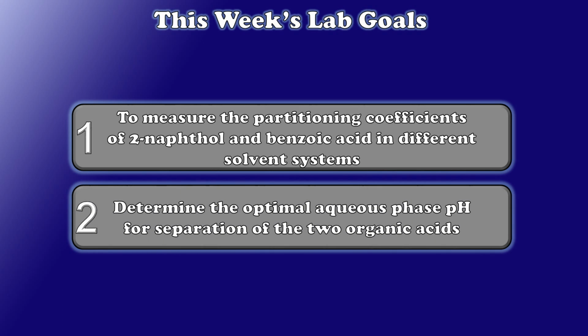Then you're going to use that information to determine the optimal aqueous phase pH for an extraction experiment and propose how you would accomplish a separation of one from the other if you needed to do so.